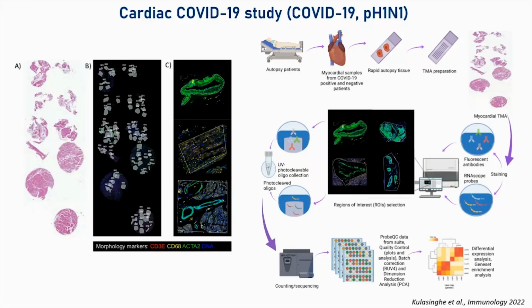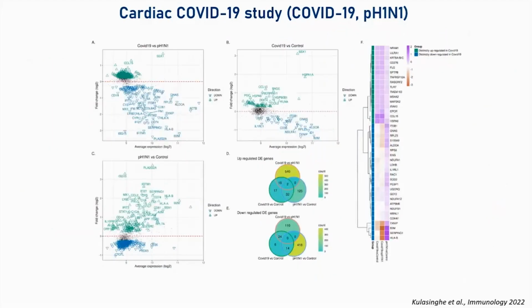And so we used this NanoString whole transcriptome approach to understand the different structures within the tissues, and then did some differential expression analysis. This work was published earlier last year. And what we saw, to our surprise, was that COVID-19 and flu looked quite different. In the cardiac tissues, we couldn't identify viral presence by RNAscope, but we could see transcript differences between the groups.